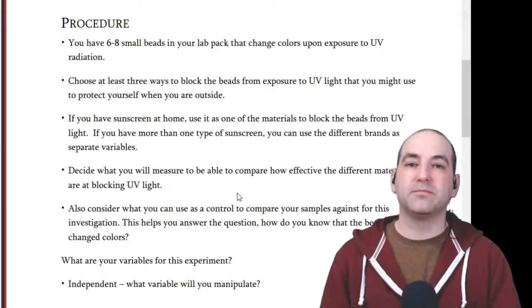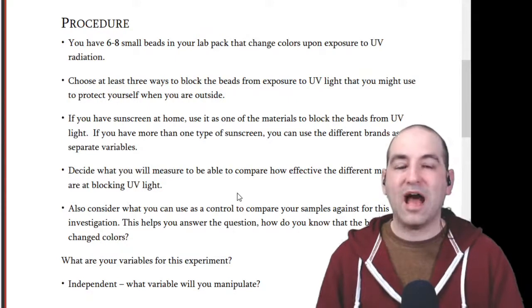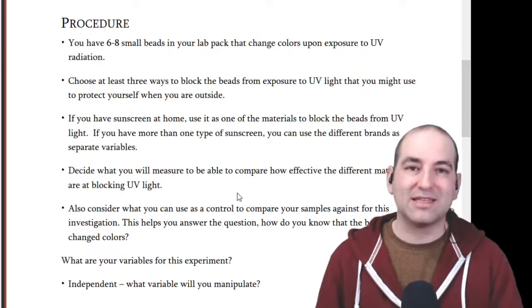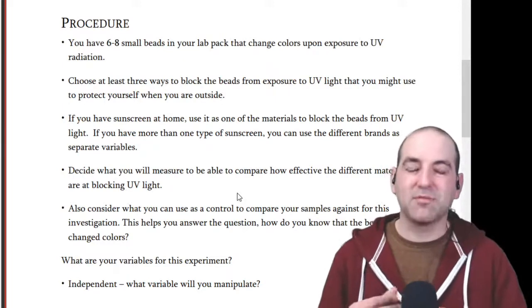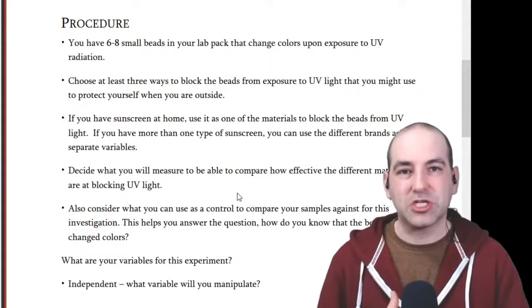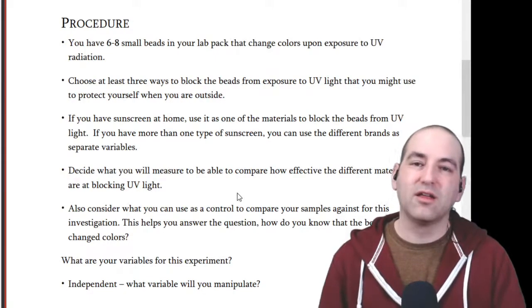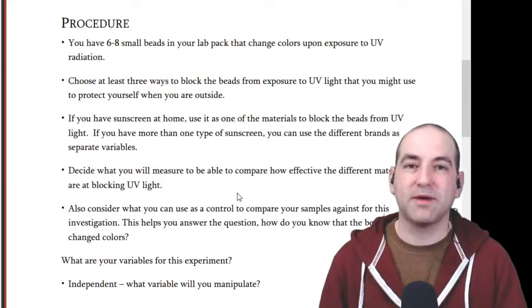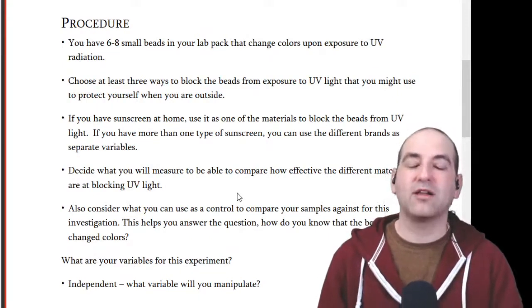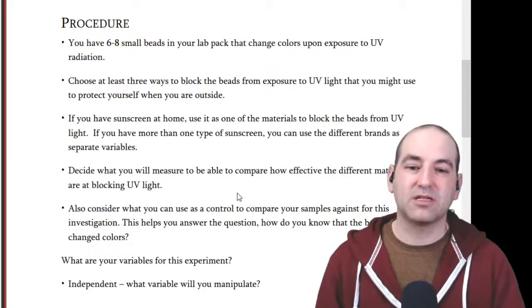Well, one thing that's really difficult in this experiment, if you're using sunscreens, how do you get a consistent layer of sunscreen on the beads? You're either spraying them or rubbing cream on them or something, but there's going to be some variation there. So, keeping that uniform in every trial is going to be really tricky. You can come up with some ideas of how to try to keep it consistent, but that's ultimately going to potentially be a problem.